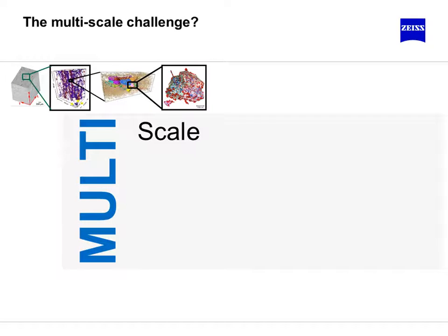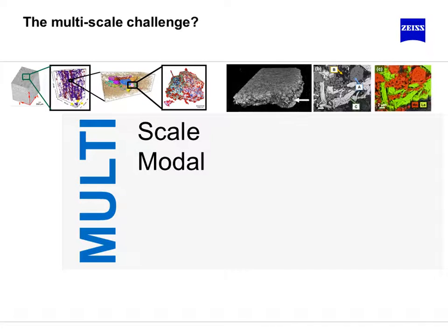And so we've talked quite a bit about different length scales here, but what really is this multi-scale challenge? Or is it just a multi-scale challenge? And of course you have examples, as Paul nicely showed, of mechanisms that occur across a variety of orders of magnitude and spatial resolution, obviously temporal as well. But the practicality as a microscopist is that you often choose your experiment or your characterization based on the contrast mechanism. What types of information? Is it just density I'm after, or do I need some other types of information, some chemical information? So the choice of that is quite necessary as well.